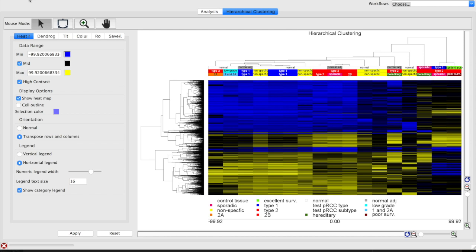In this installment, I use Partek Genomics Suite to select a group of clustered genes in our meta-analysis. I then import these into the networking platform String, which is a freeware gene-protein interaction network, and Elsevier's Pathway Studio, which is a commercial product, to derive biological meaning from our list of genes.